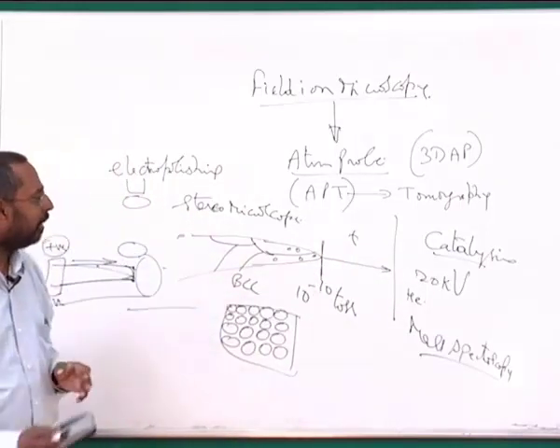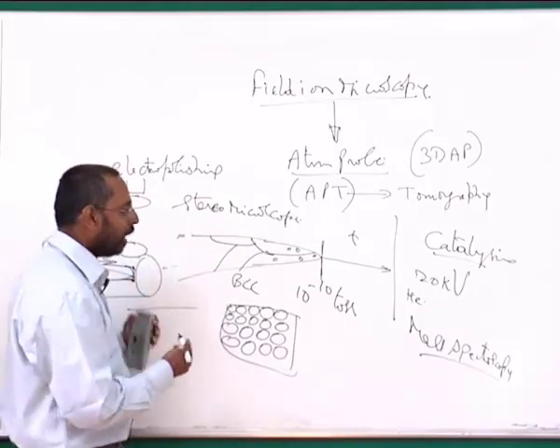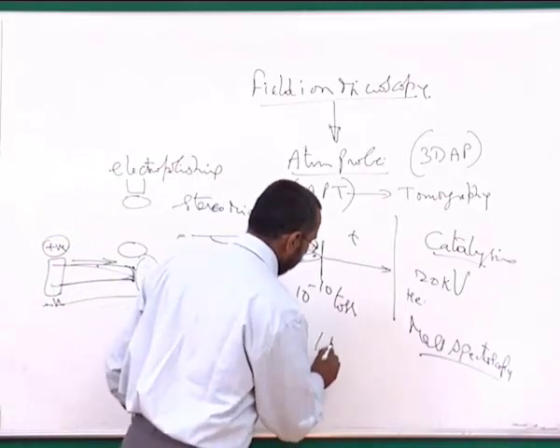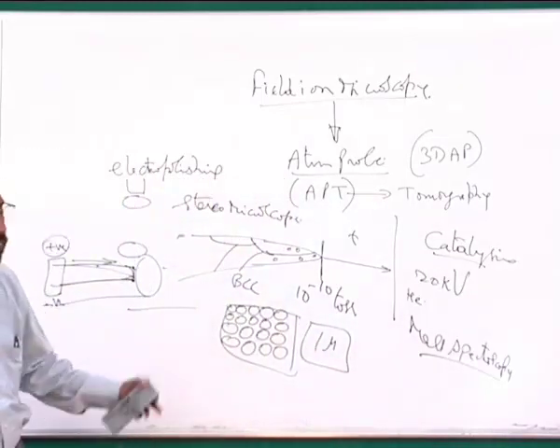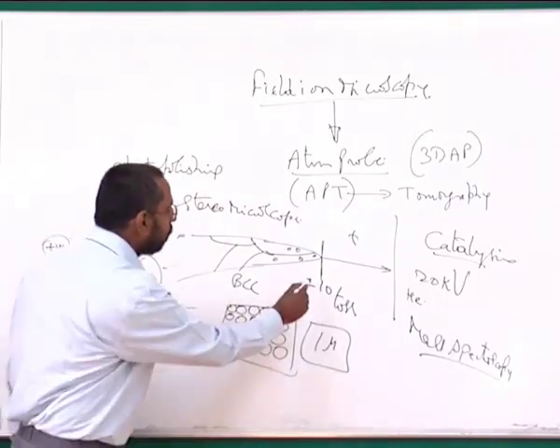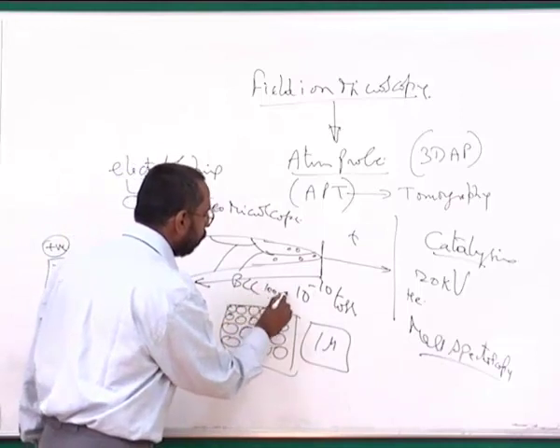Of course, the limitation is we do not see sample sizes more than about a micron. This, I would say, possibly is the largest size that we see. So most of the depths that we see are on the order of around 100 nanometers to about 500 nanometers.